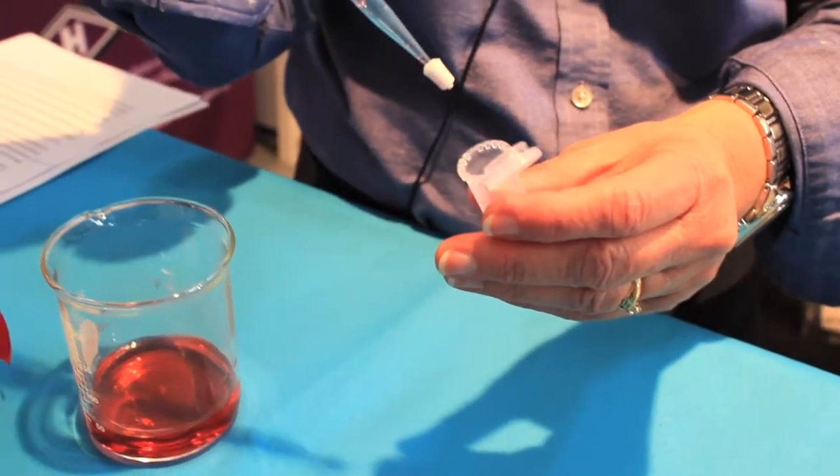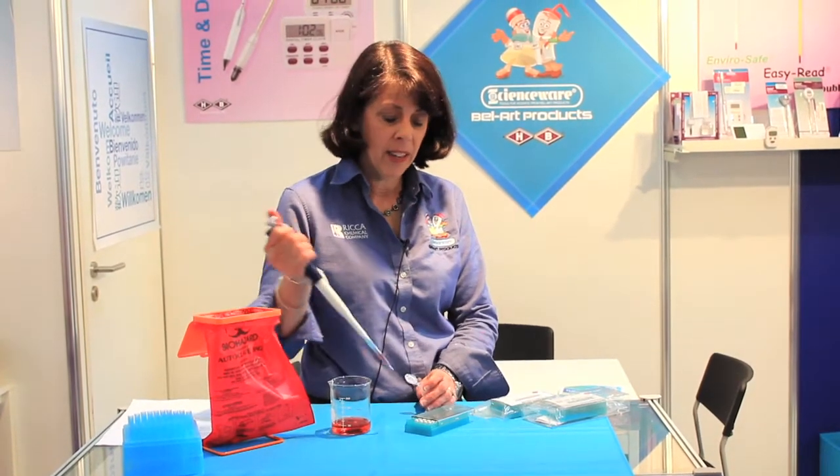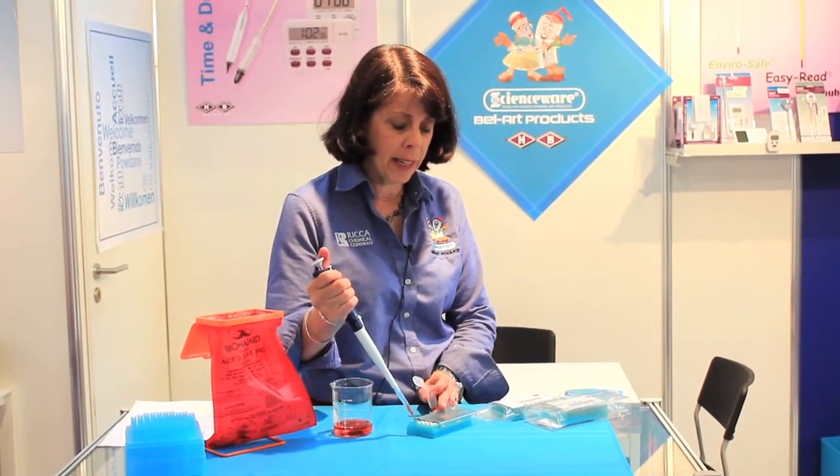In addition to on-site field testing, we've also had FlowMe tested in an independent testing laboratory. In addition to FlowMe being extremely effective in filtering out cellular debris, FlowMe has been found to be superior in retaining your sample volume and cells.